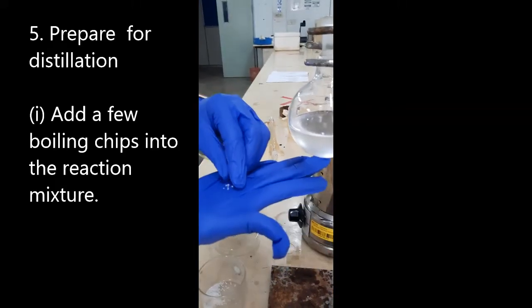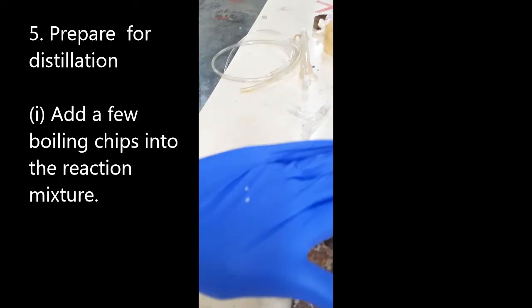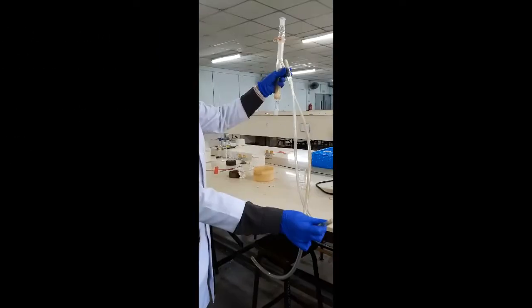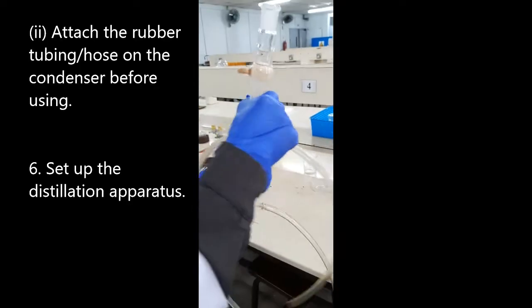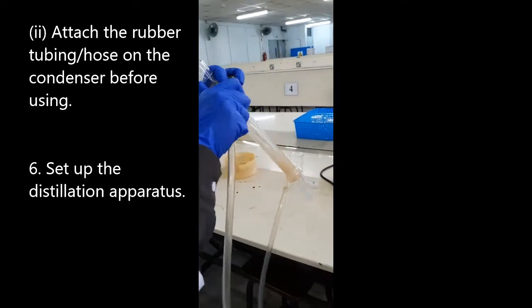Next, prepare for distillation. Boiling stones must be added whenever organic liquids are heated in the round bottom flask. You should always attach the rubber tubings on the condenser first before assembling the distillation setup.